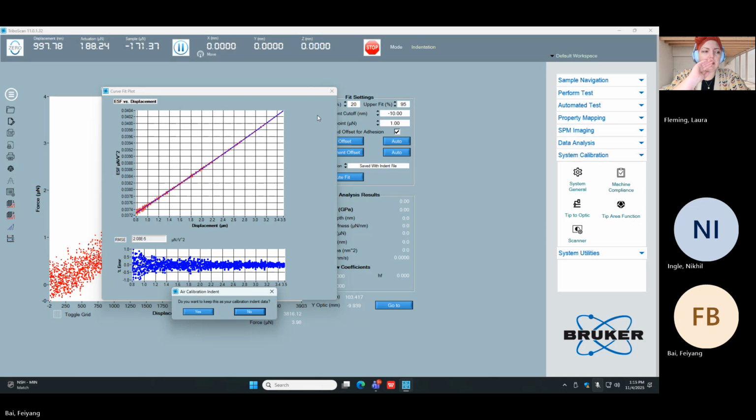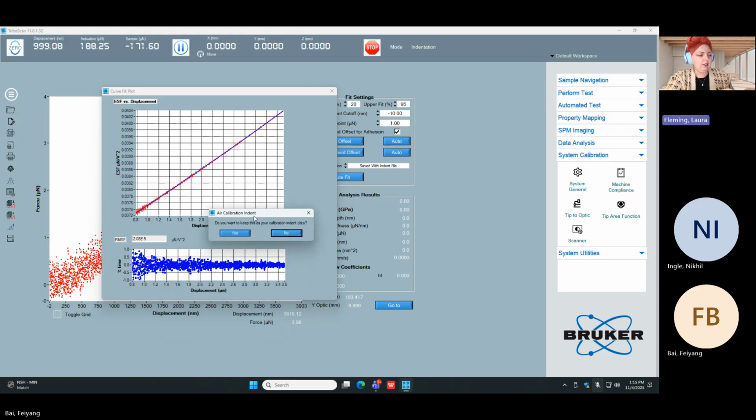So it's going to depend on your environment. There are slight changes that are changing that plate spacing, which is going to change the electrostatic force factor that we have to apply. So when you do this air cal after you've left it for a day, it's no longer correct. It's no longer the same as it was yesterday for whatever reason. And so now it's no longer flat.